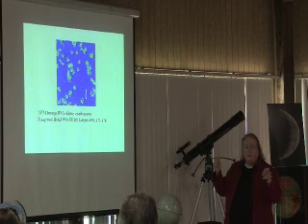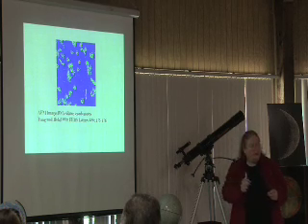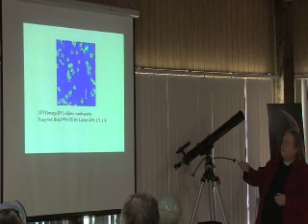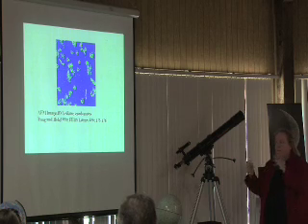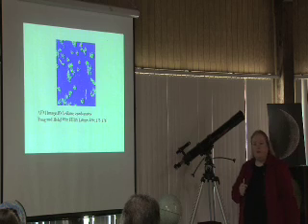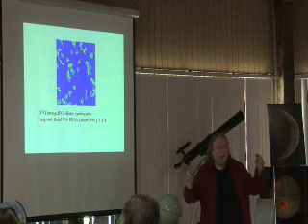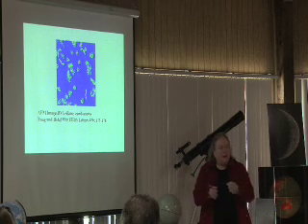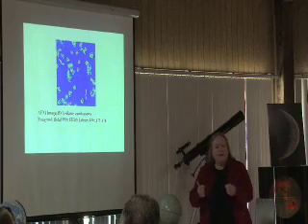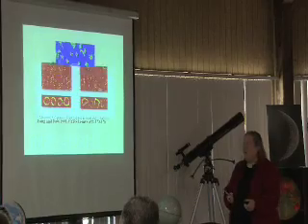So what this image from the college lecture is, they bind some molecules to the DNA. And we're trying to study how those molecules bind to DNA. And so you see the little bright red spots. When they bind, you can see where the red spots are. You can actually see molecules bind to each other. You can study chemical and biochemical reactions with an atomic force microscope. You can see where they bind. It's a different way of thinking about science, to actually be able to see the chemical reaction.